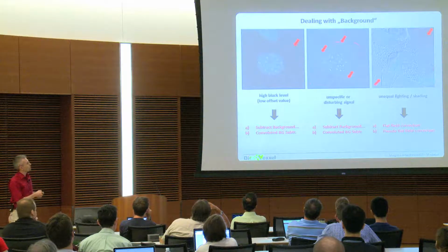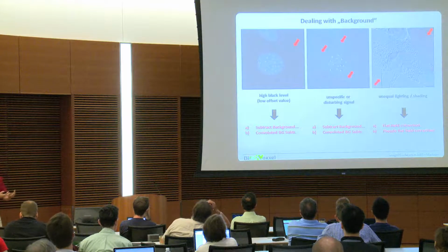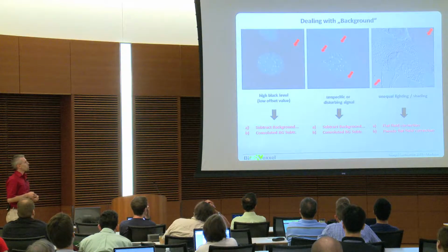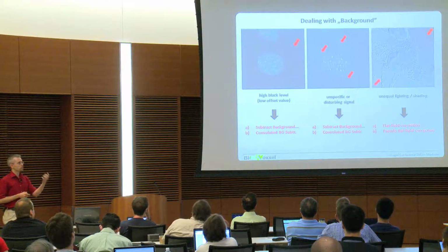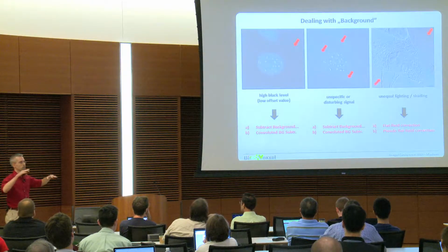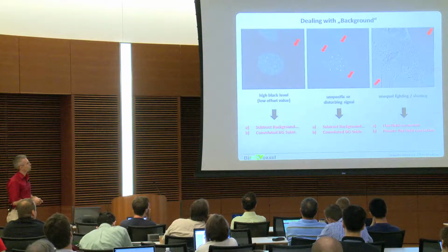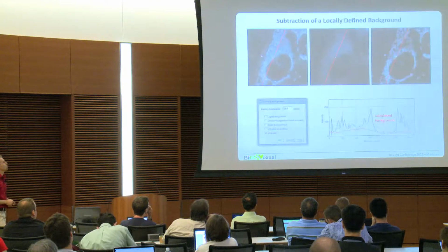If you have things like that, which is rather unspecific staining, which for a later extraction is hindering your extraction of those spots, then obviously a subtraction of a fixed intensity value is not working, because everywhere in the image there are different intensities. So we need to make a fitted background, which those two functions we'll talk about do, and we can also correct unequal lighting. This is what we want to go through.